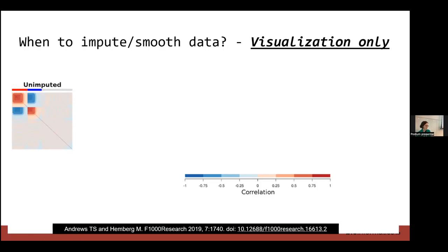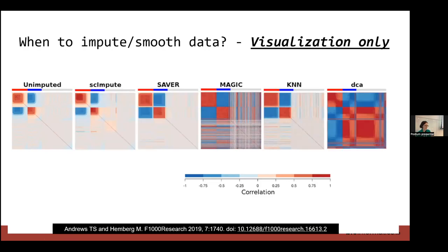Some imputation methods are worse than others. SCImpute only affects a few genes, SAVER only changes a few, but with MAGIC, all genes that aren't actually differentially expressed between cell type A and cell type B become differentially expressed between them. These tools are essentially saying this cell is similar to that other cell, therefore its gene expression should be similar, which creates signal in your data even when there's just random noise. The main argument for imputation is that it makes plots look really awesome - correlations between two genes go from 0.1 to 0.9. I recommend not using imputation.